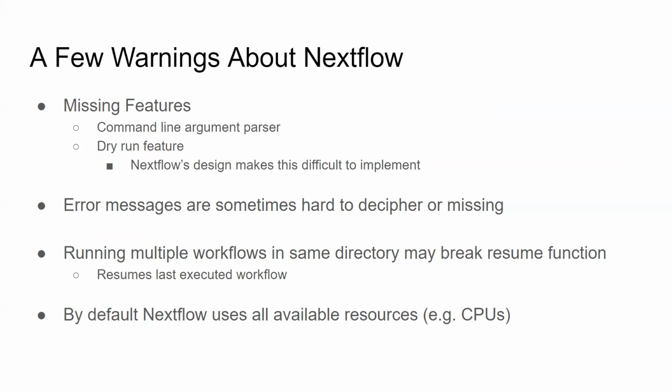There is no dry run feature, and it would be nice sometimes, before you're about to launch this large job, that you could just say dry run and it'll say, this is what I'm going to run, instead of running it and then figuring out what's going to run. But that's likely not going to be possible the way Nextflow is created. The main developer also said it's way easier to just create a small test data set and run it and see what happens. Because of the way Nextflow is, it's event based, so those channels have to be filled for the process to execute.